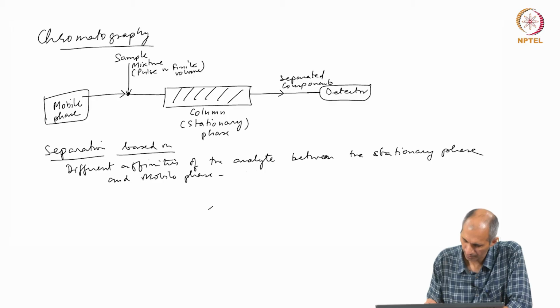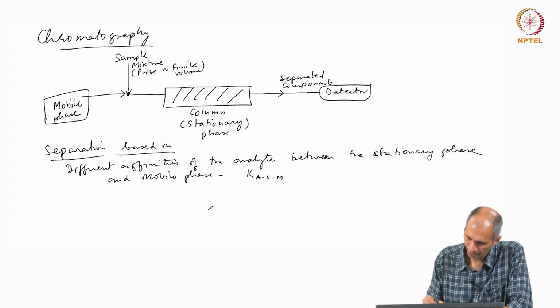So, in other words, we are talking about some partition constant between the stationary phase and the mobile phase.